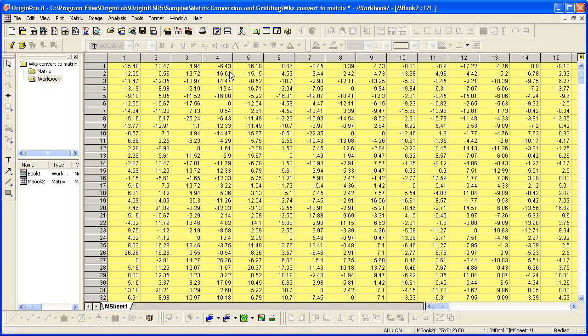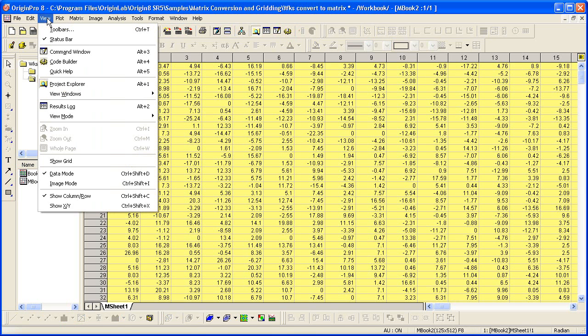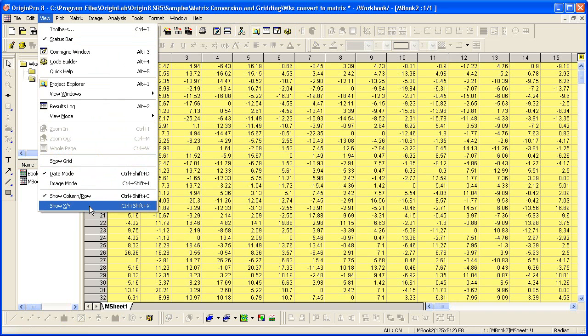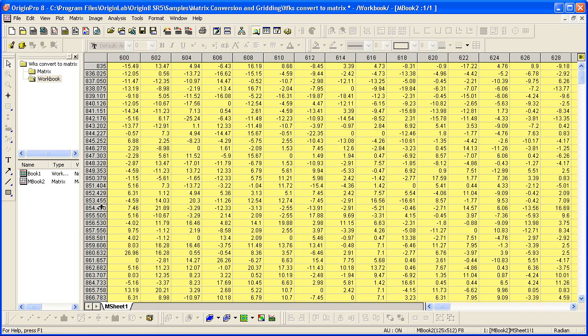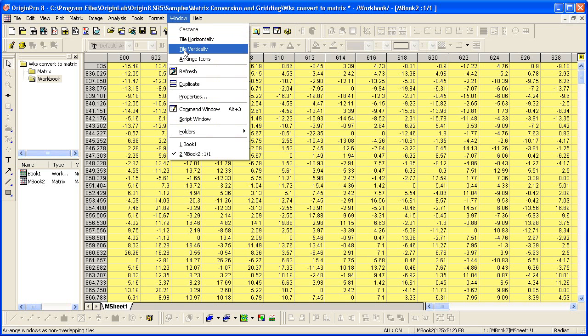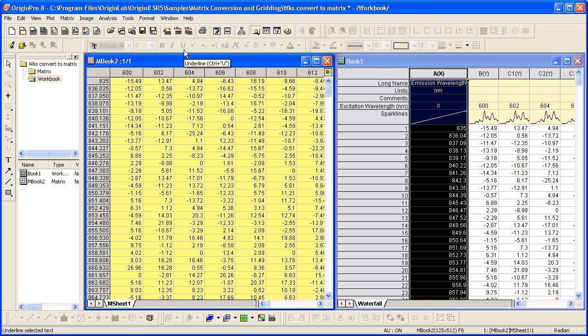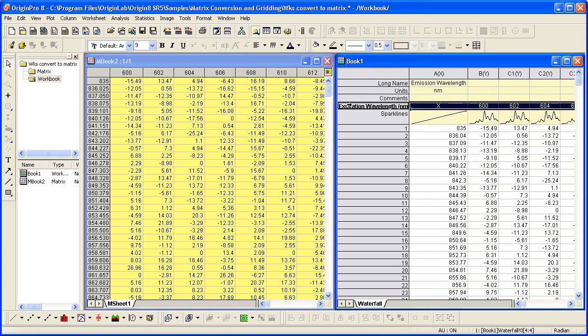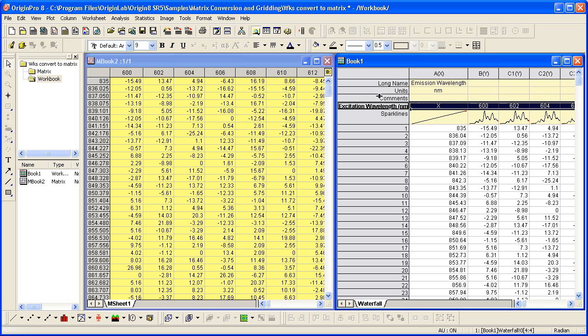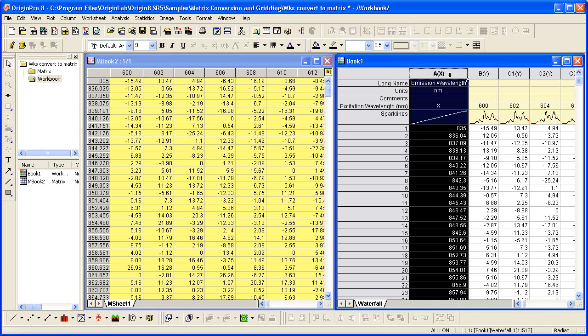To view the linearly spaced X and Y values, I click view, show XY. Now the actual XY coordinate values of the matrix are shown. I'll tile the worksheet and the matrix so that you can see that the X values in the worksheet match the values in the top header of the matrix. And as for the Y, the matrix left header are very close to the values in the first column in the worksheet. Origin interpolated the values so they are evenly spaced.